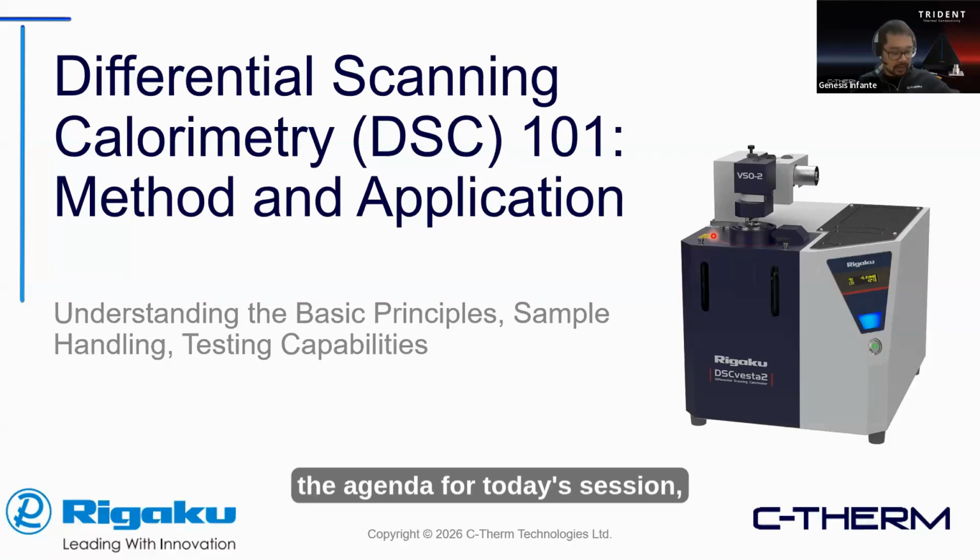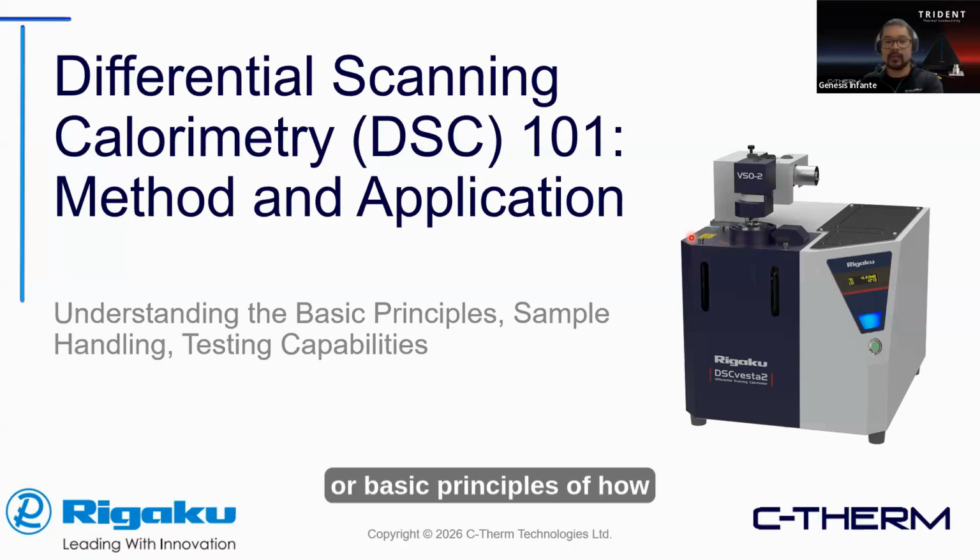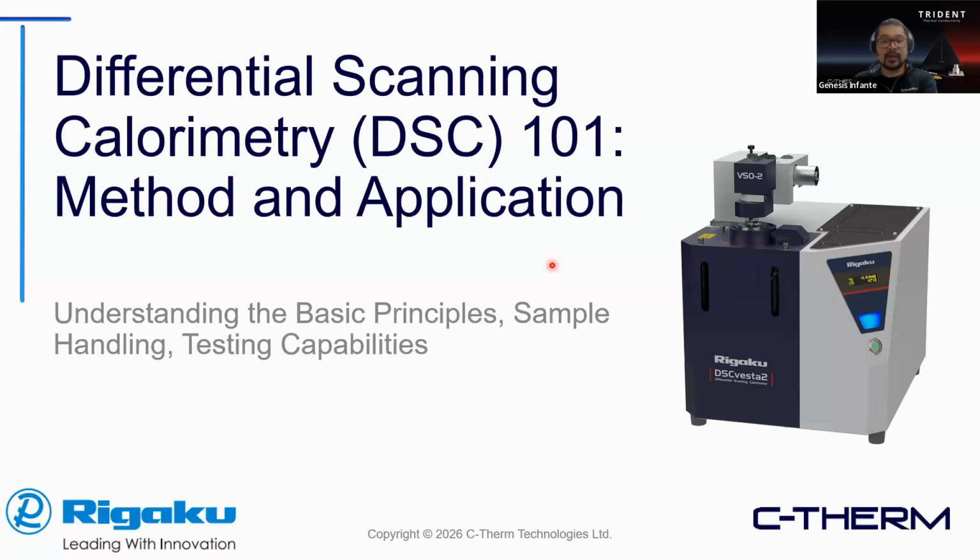For the first half of today's session, I will be covering the more fundamental principles of how the technique works, and some basic guidelines on how to do the testing under the DSC technique, for better sensitivity and resolution, anything relevant to understanding the thermal properties of your material.